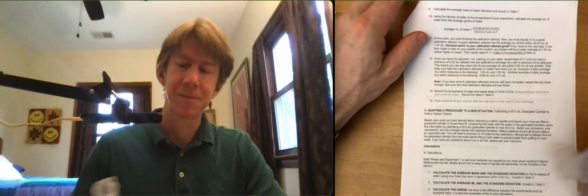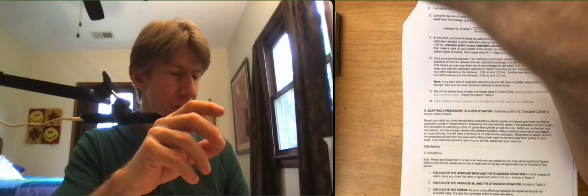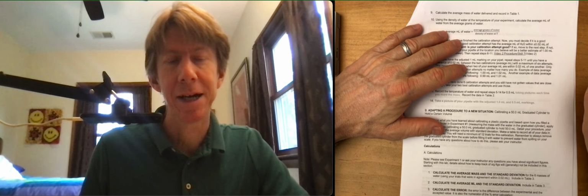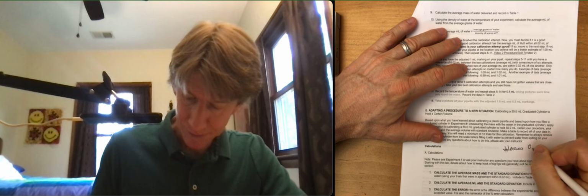A couple hints. One is, so you're going to fill it to the 50 line and you're going to weigh it and you're going to see if you get 50 milliliters. Your tolerance for this, and I'll write this tolerance in here, is 0.1 milliliters, plus or minus 0.1. So 50 to you is 49.9 to 50.1.